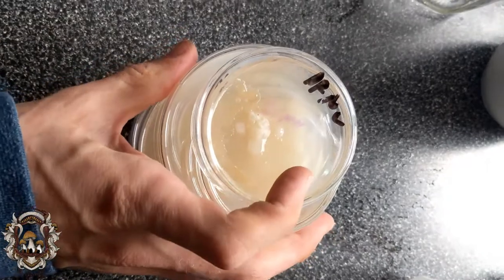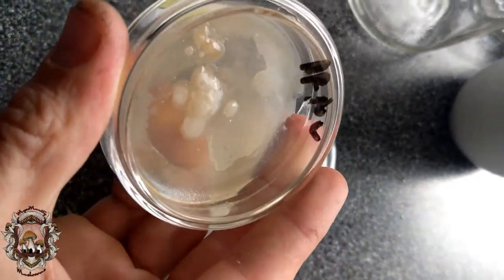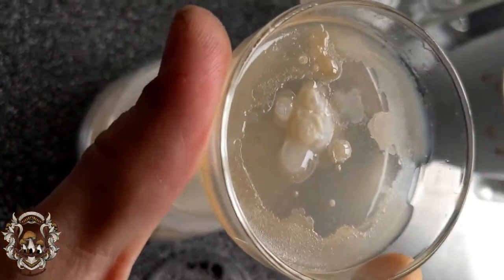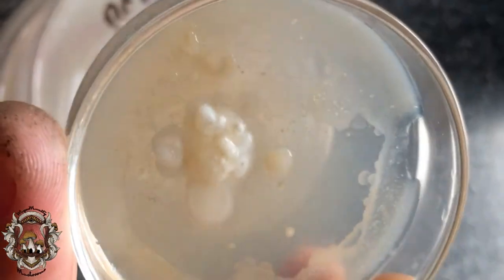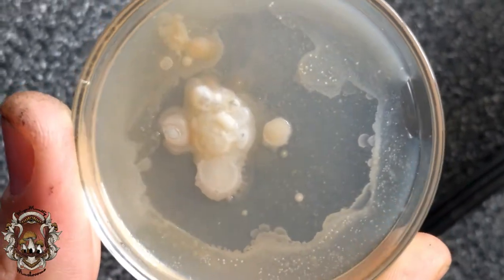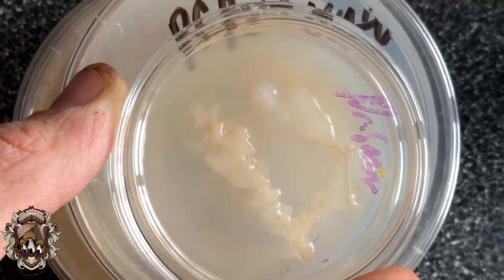Time before we get rid of them. It's been probably about 2.5 weeks. I'd have to double check the dates on that, but this was just the powder right on the dish. It was wet, so that's why that rings all the way around the outside. But get a closer look at this. Spray that down a little bit. This was the water solution. Smeared it.